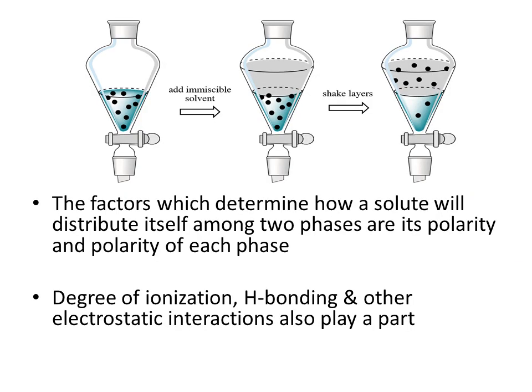In this slide, the process of solvent extraction has been shown in the form of a figure. We can see here we have the separating funnel, and we have taken the solution containing the solute, whose components we are interested in separating. We'll add another solvent, solvent B, which is immiscible.